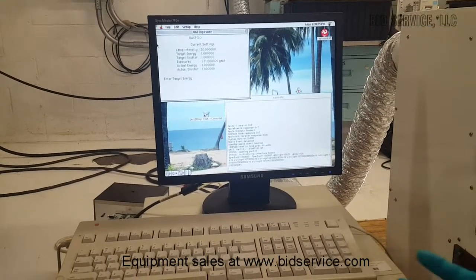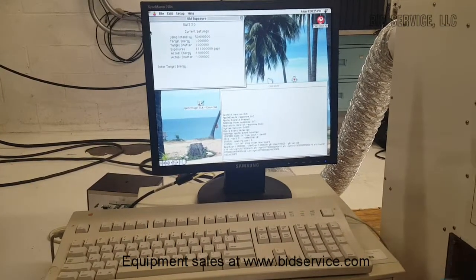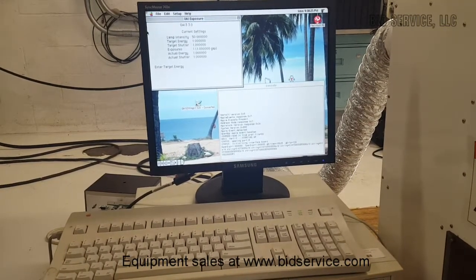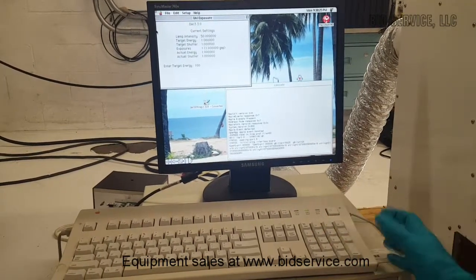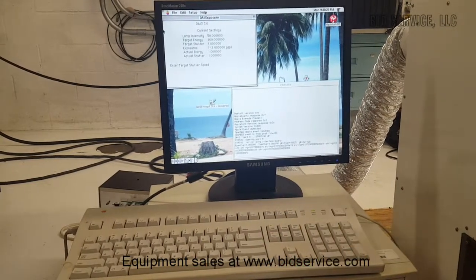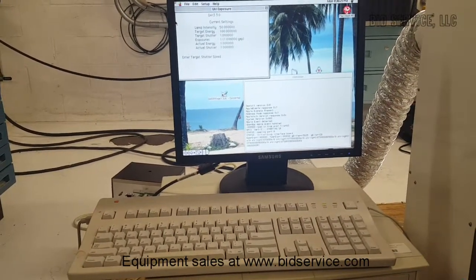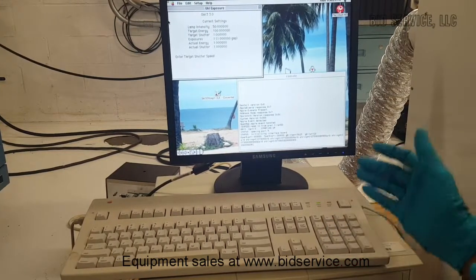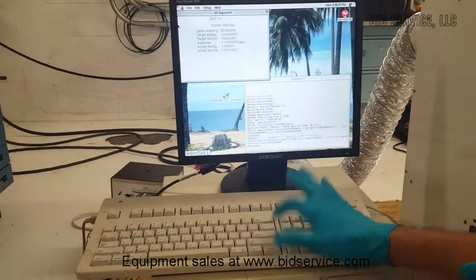Enter the target energy, that is the energy we need to expose on the samples. This energy could be a number that is desired, for example 100. Once I select that and press return, now enter target shutter speed. Here we can enter a fraction or even a digit like 10.